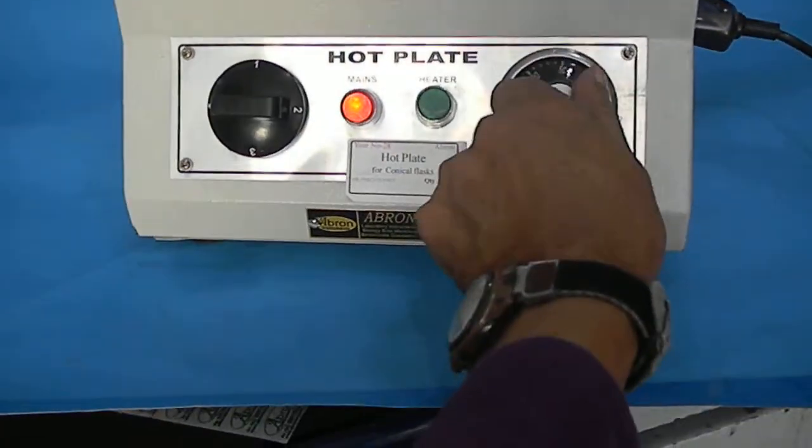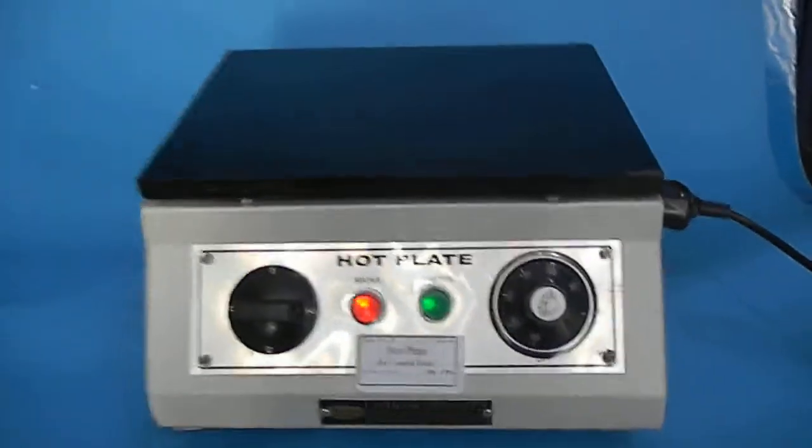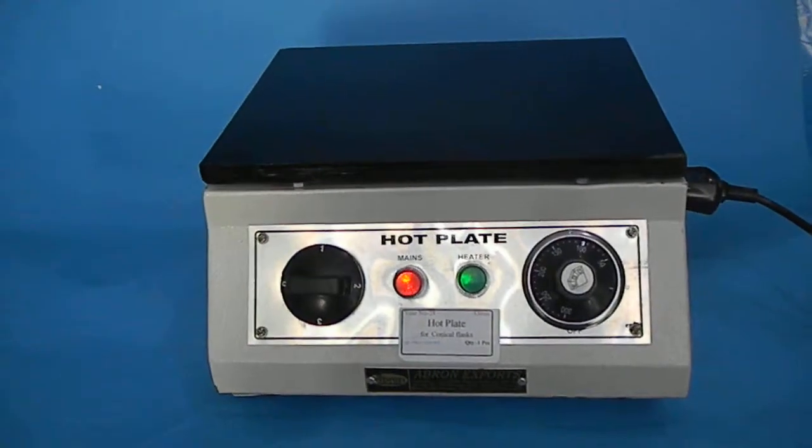When the switch is off, when it is on the lower it works, and when it is on the higher. It is a 10 by 12 inch rectangular size; other sizes are available. Please visit our website.